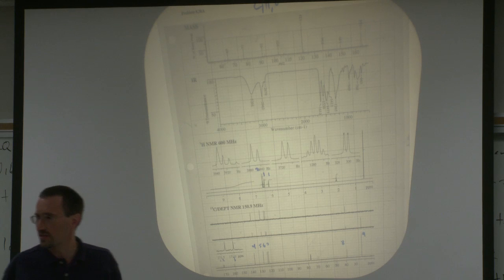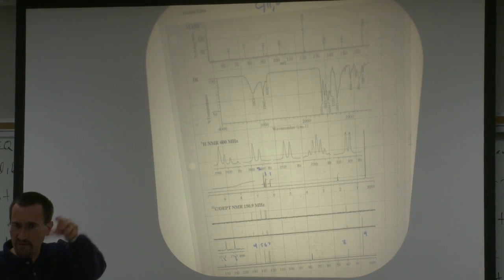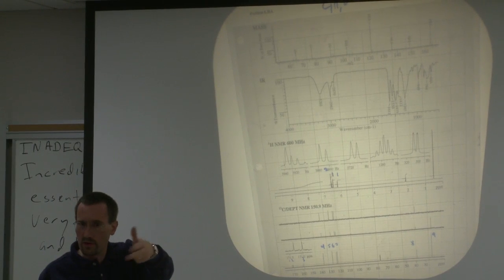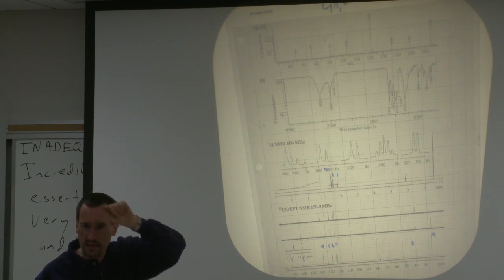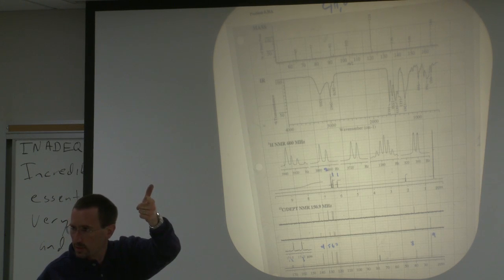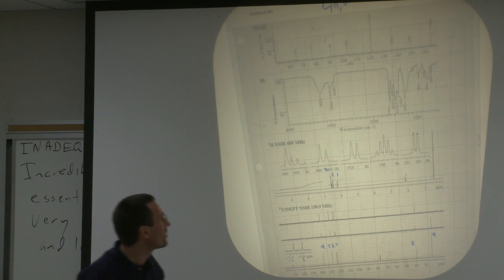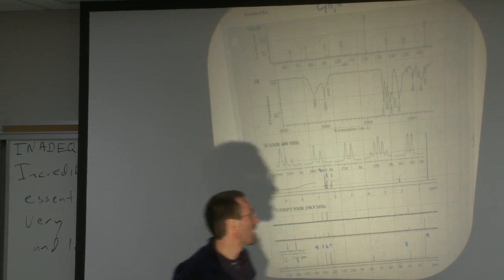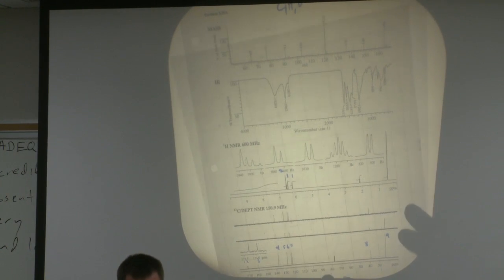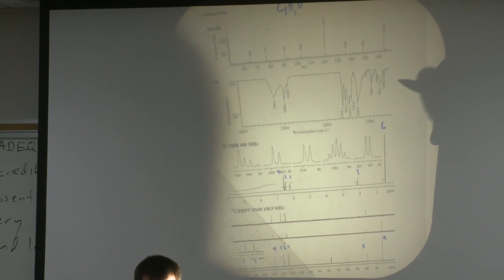But if you're being lazy, you can say, okay, because otherwise you're putting all that weight on 1.7, and if the 1.7 is really 1.5, then you come to a peak that's like 9 hydrogens, and that error of 10% is going to make your 9 hydrogens be 10 hydrogens or 8 hydrogens. But if you're pretty good here, you probably can get away eyeballing it as 1 and 6, right?